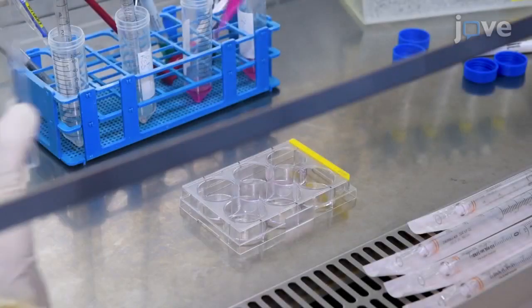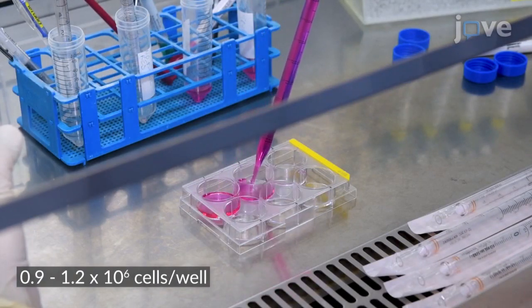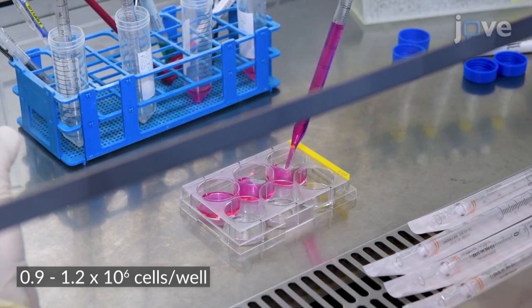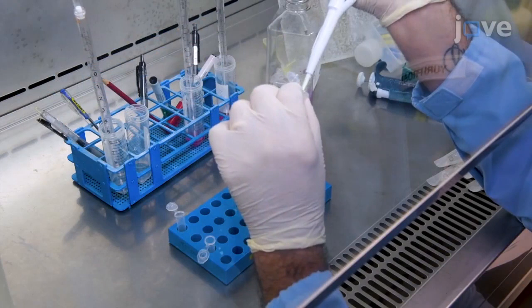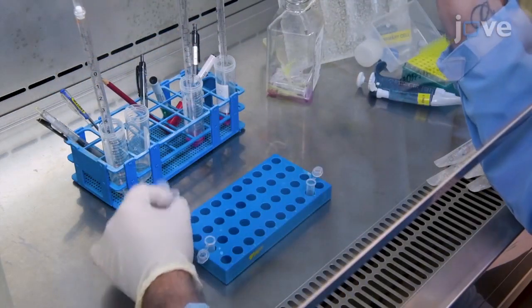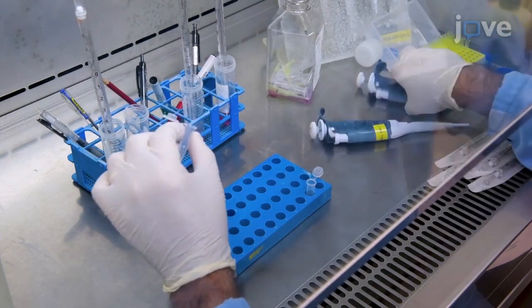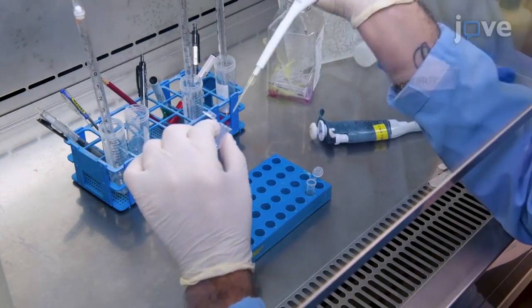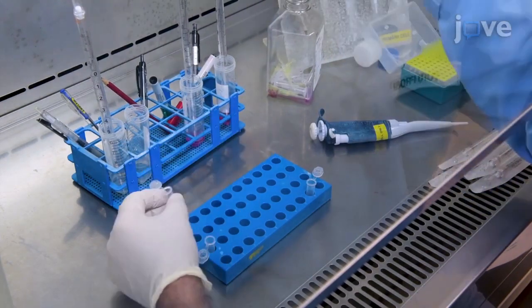After thawing and counting cells, seed 6-well plates with HEK293 cells, using 2 milliliters of standard growth medium per well. On the morning of day 2, for each planned transfection, dilute 9 microliters of liposome-based solution in a tube containing 125 microliters of reduced serum medium without phenol red.